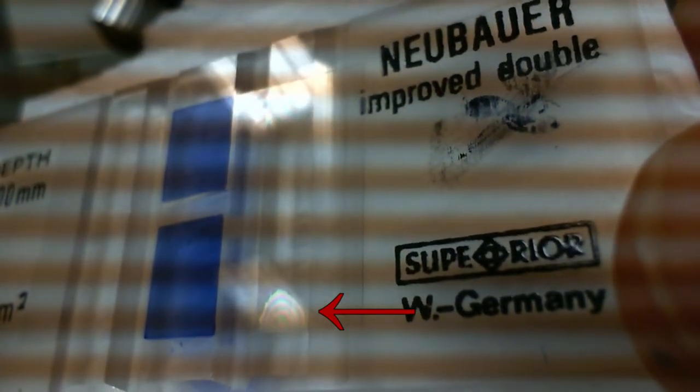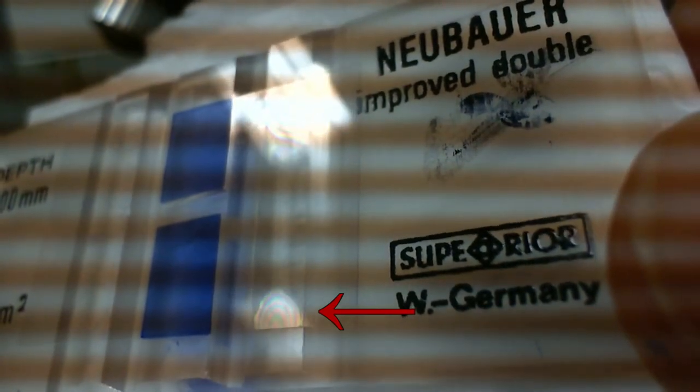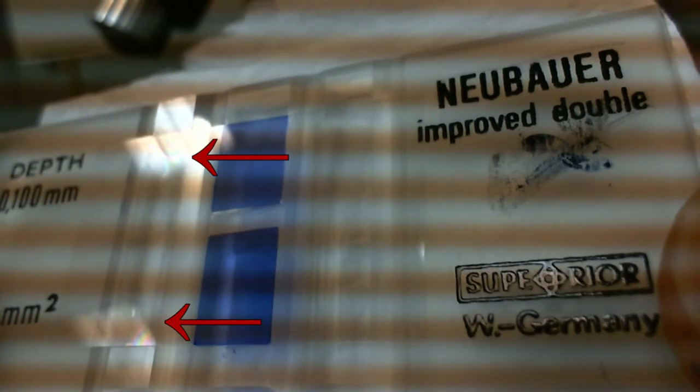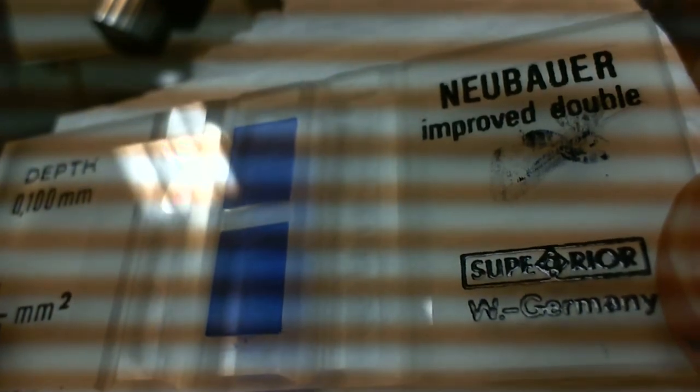Right at the bottom of the shoulder and right at the top, you can see them alternating light and dark lines. They're not quite black and white, they're kind of white and colored. Let's see the other side as well. You can make them out here as well. Okay, so there they are, finally. Took a while. I was able to capture them. I hope I'm recording this. Okay, so those are Newton's rings. That's what you're looking for.